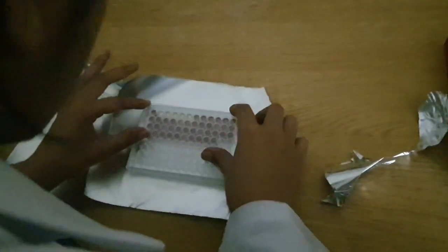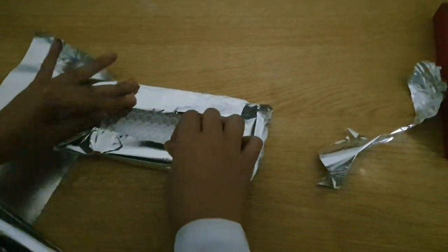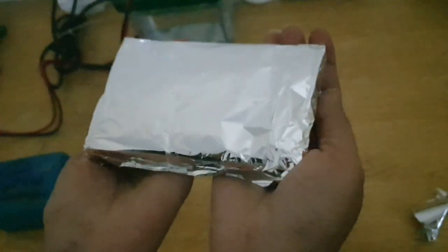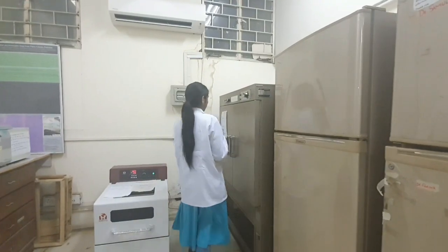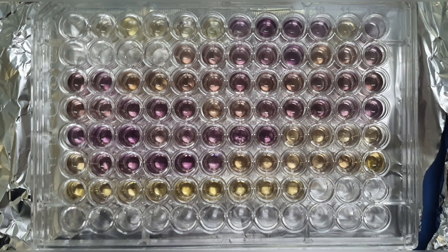And then we will wrap it in the aluminum foil and incubate it for 1 hour. Now, have you noticed that change in color? The compounds with strong antioxidant capacity have reduced DPPH, and that has changed color from deep violet to yellow.